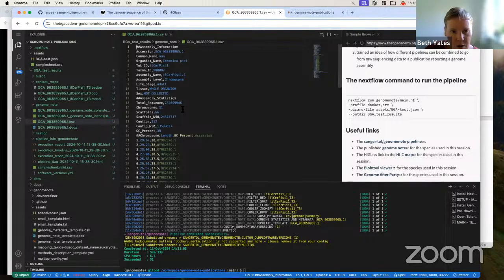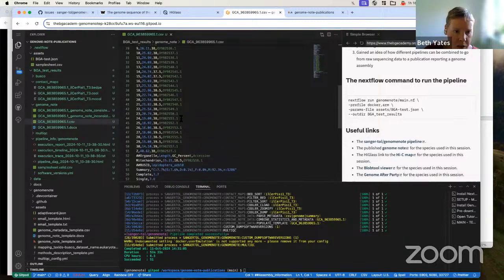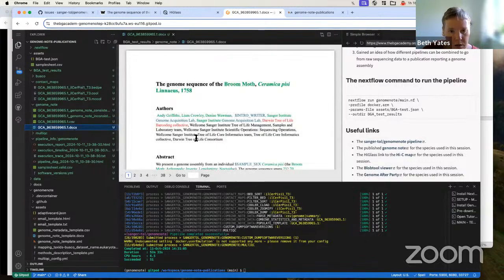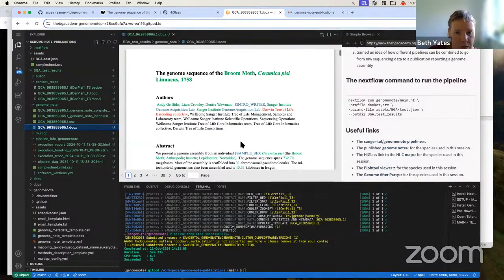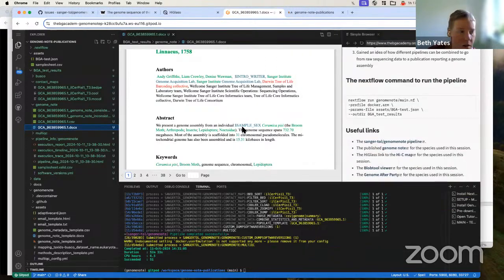from the genome statistics workflow. So this is where you get your chromosome list from. We do some nice formatting on that before we add it to the template. So we do some rounding on these numbers. There's your BUSCO score, QV score, the completeness, and then the completed Genome-Note document. That should hopefully match up to what I'm showing you here. So you can see whether yours is finished or not, it should work eventually.